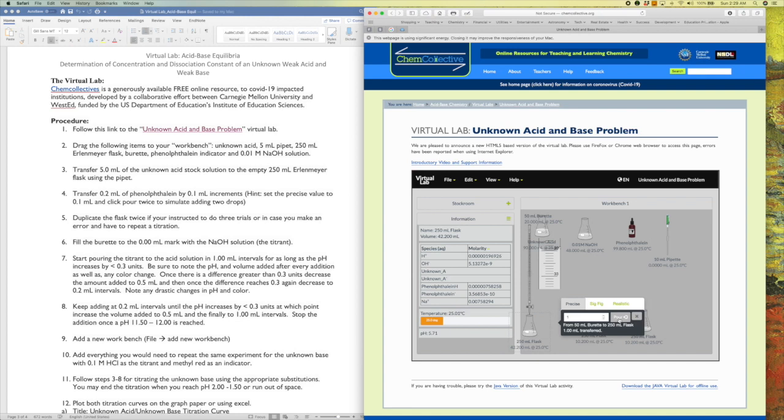That was 0.06. So the amount by which the pH increments are increasing might be getting a little larger, right? So we want to be careful now. So that went up by 0.05. Ooh, that went up by 0.07. Okay, but that's still okay. Remember that as long as we're below 0.2 to 0.3, we're good.